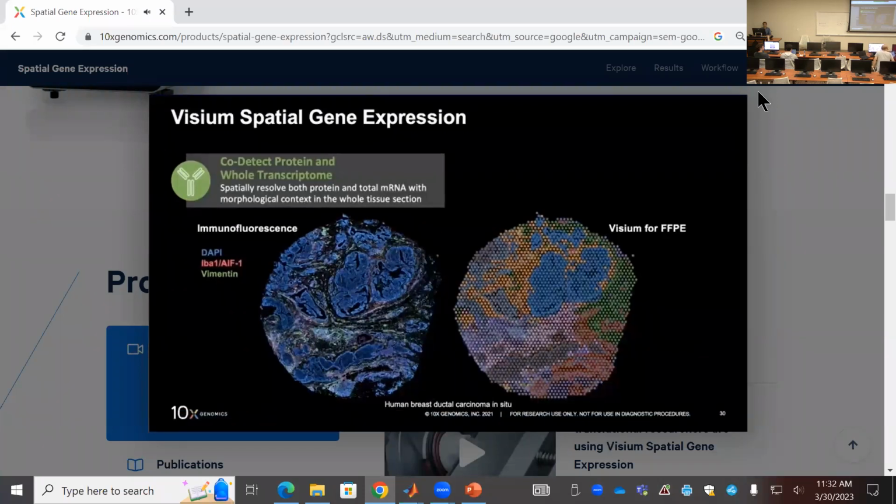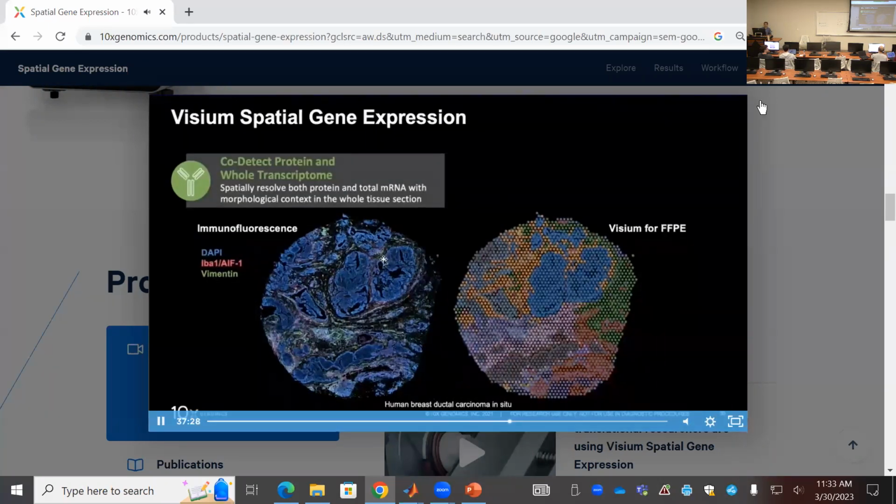There are a lot of discussions and tutorials online, and in the field, there's hype. People want to do this to understand the different cell type interactions with the spatial information you will get. For example, a solid tumor and its periphery tissue and the cell type microenvironment can be described more accurately than with dissociated single cell analysis.